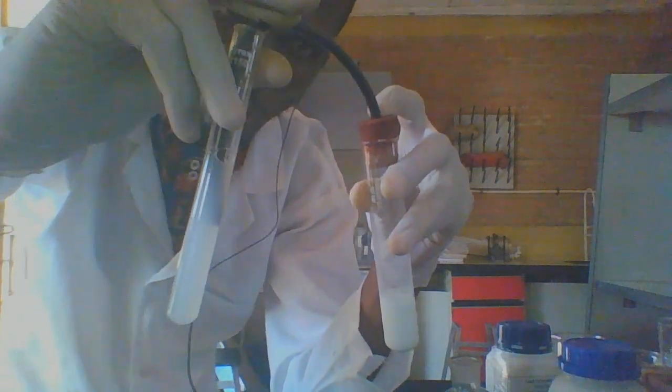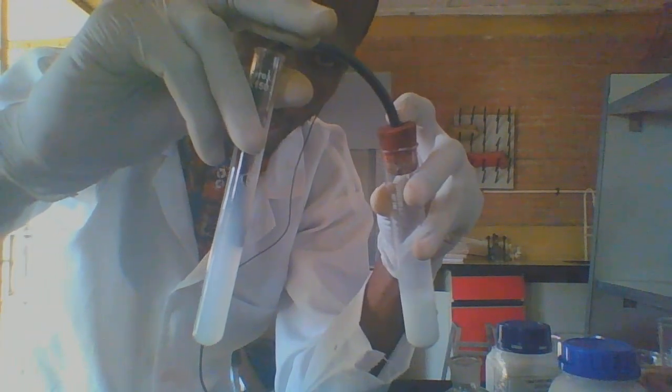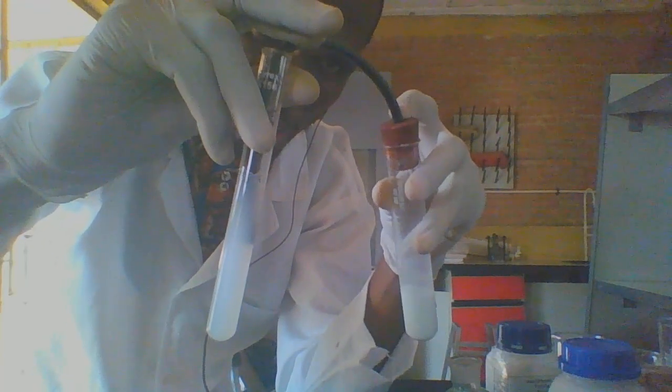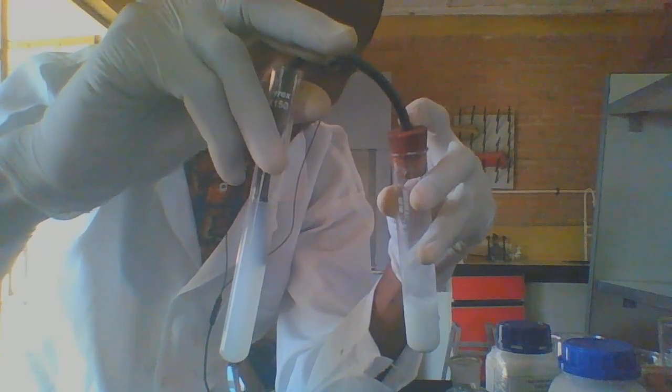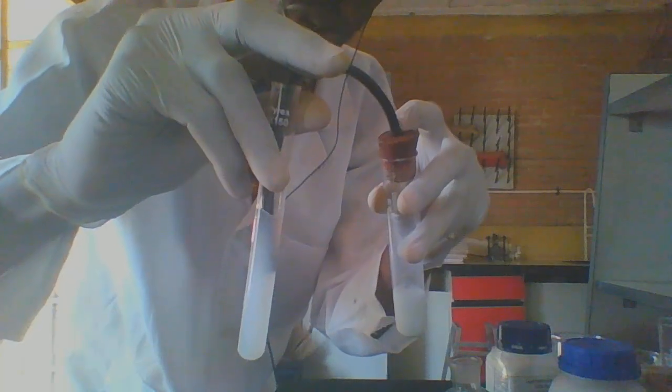Now, if you had earlier dissolved in water and filtered, you say that the gas is carbon dioxide from trioxocarbonate(IV). But if you've not dissolved it in water prior, you will say that the gas is carbon dioxide from trioxocarbonate(IV) or hydrogen trioxocarbonate(IV).